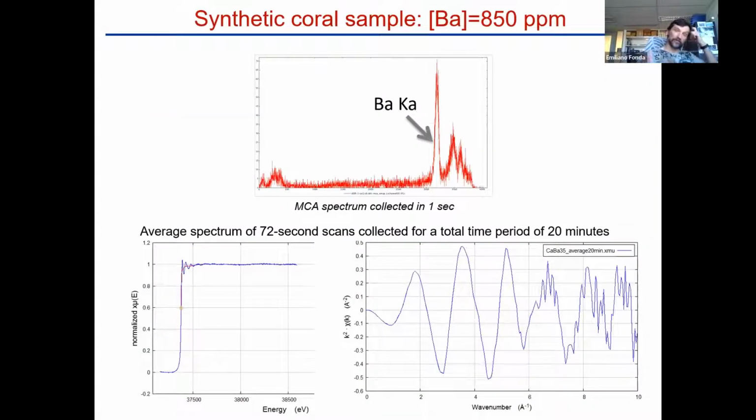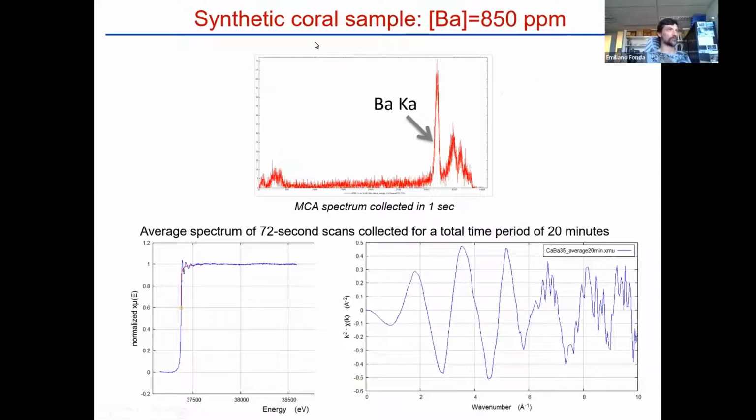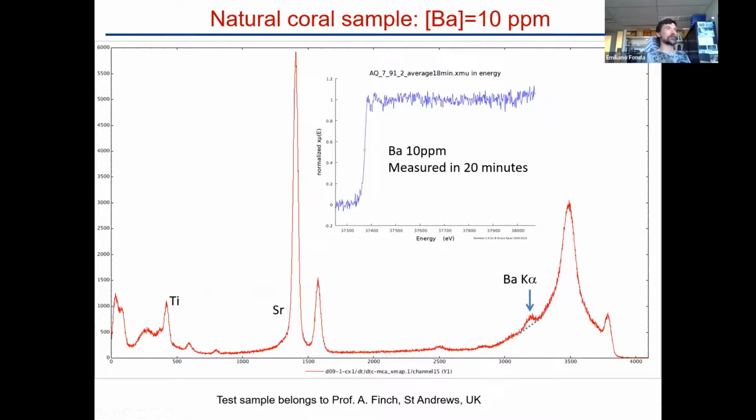So the quick exercise is done in fluorescence. Some examples just to close this part on the beamline. This is a typical spectrum we can get with barium. I can tell you, 850 ppm, so relatively concentrated. Then we can go down to 10 ppm. This is a bad spectrum, but let's measure it in 20 minutes in a complex matrix.